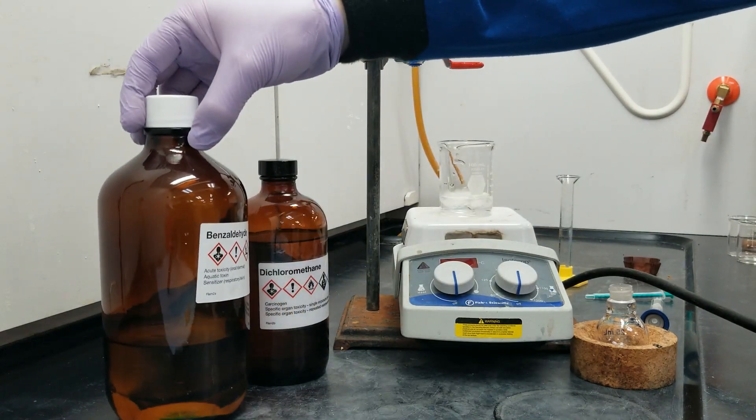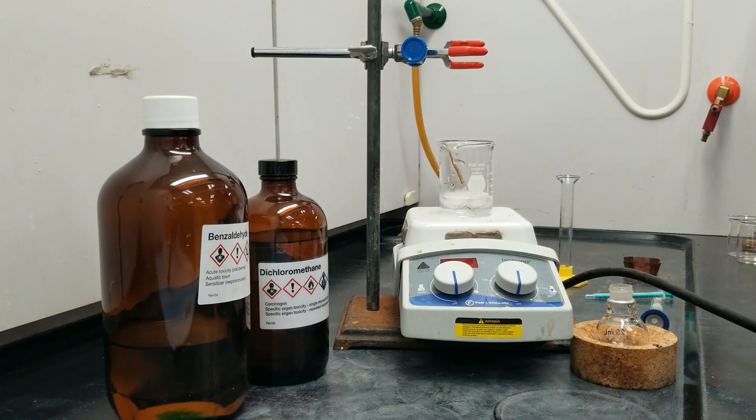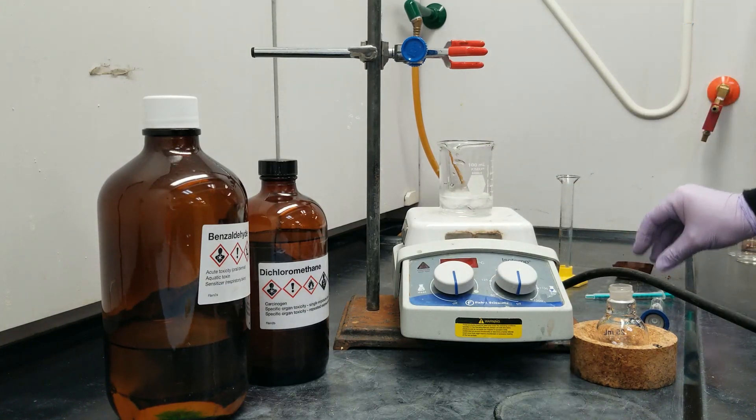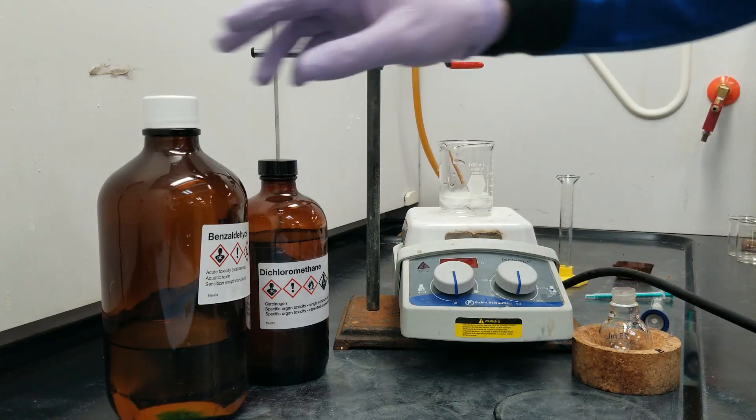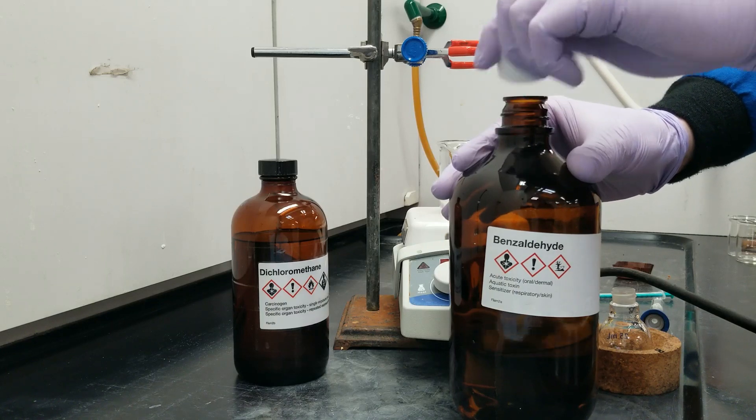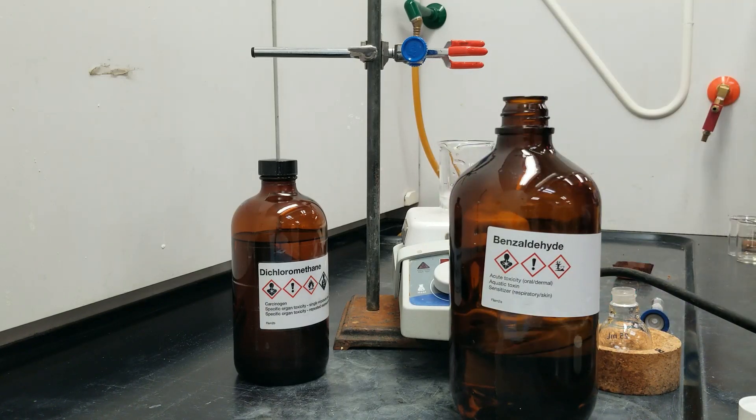This is a rather simple aldehyde, and it's going to be reacting with my Wittig reagent. So let's go ahead and start by adding 0.12 milliliters of benzaldehyde.